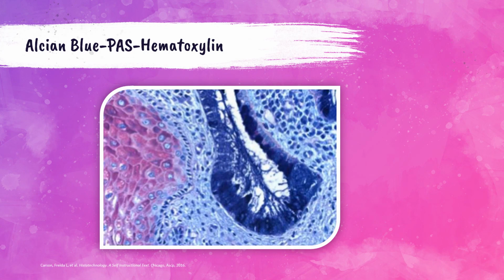This photo shows a cervix tissue section that is stained using the Alcian blue PAS hematoxylin technique. Glycogen is present here within the stratified squamous epithelium, which you can see here. All right. It's stained a rose color by the Schiff reagent. The mucin secreting gland is a dark blue to purple color here. All right. This indicates there is a mixture of both neutral and acidic mucins.